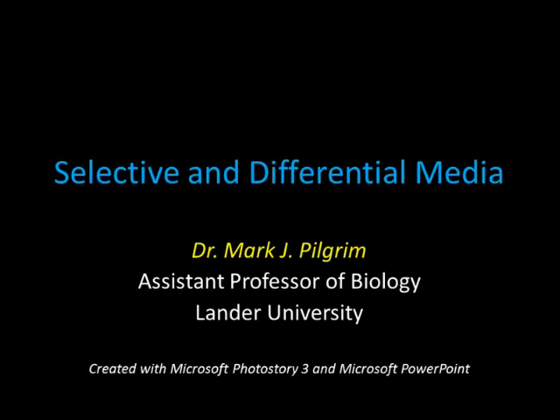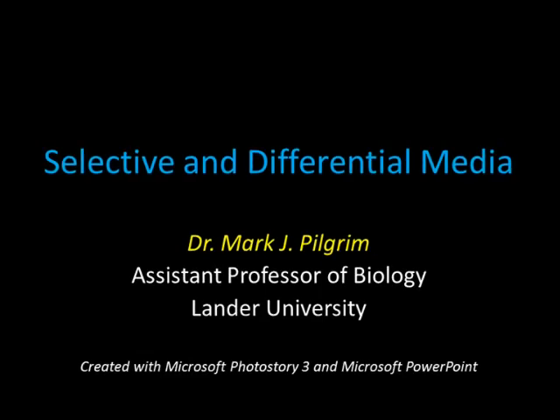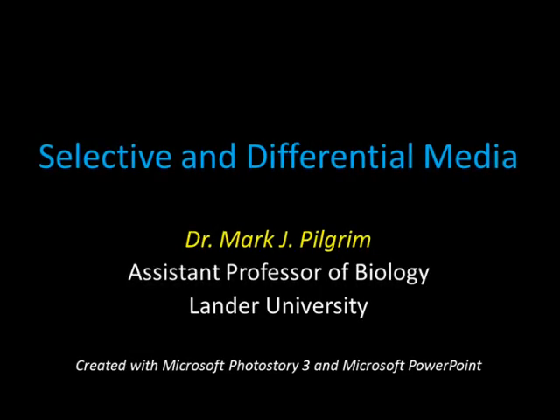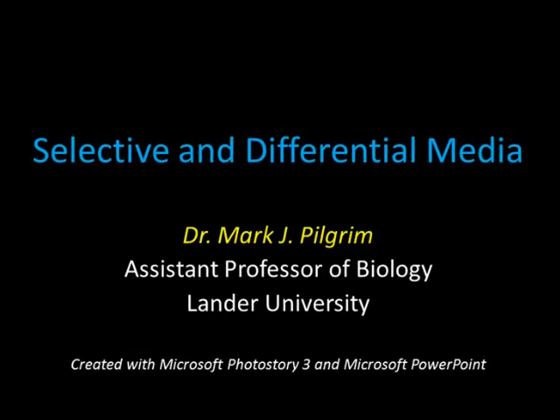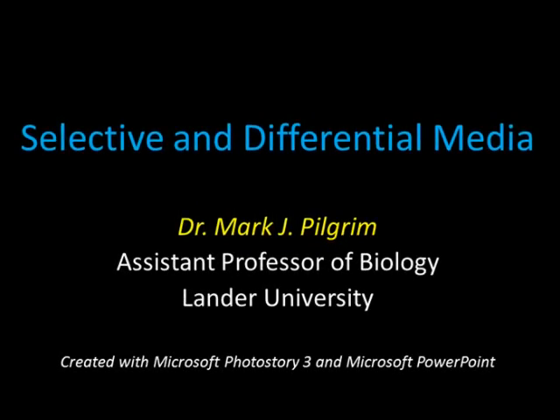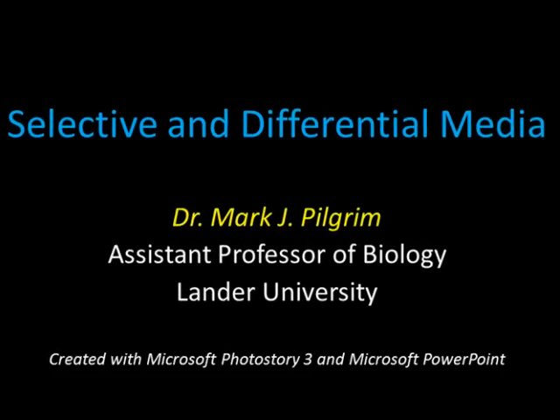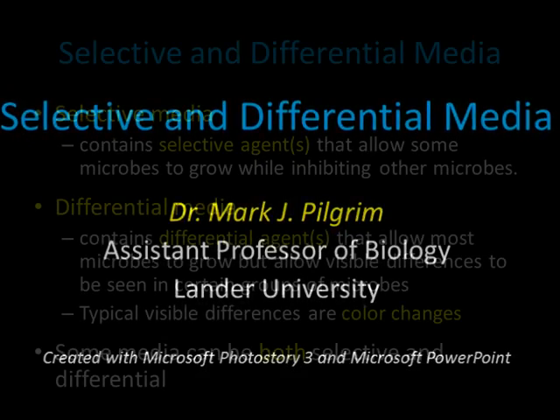My name is Dr. Mark Pilgrim, and I've created this photo story to introduce you to selective and differential media and the interpretation of that media. Selective and differential media can be used to both isolate and differentiate groups of bacteria. In the microbiology lab, we use a variety of these media to study microbes.